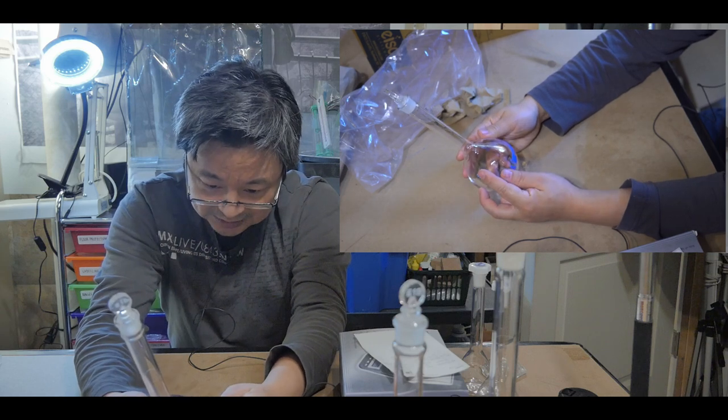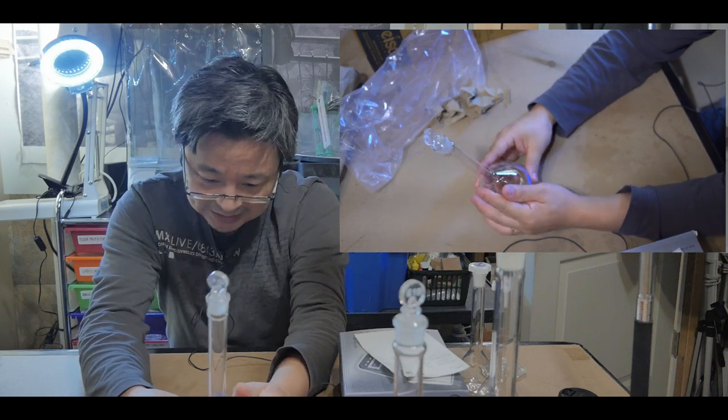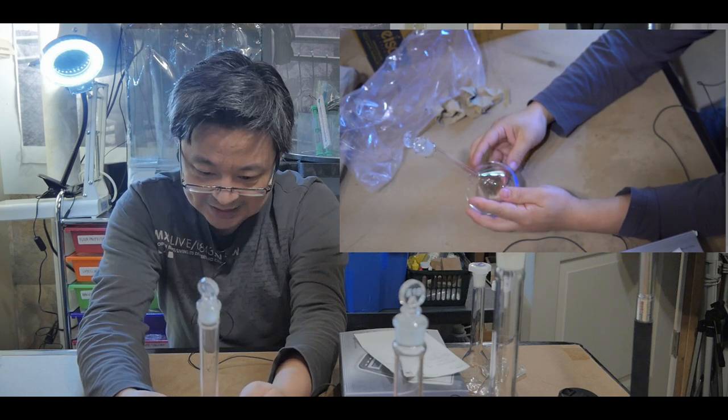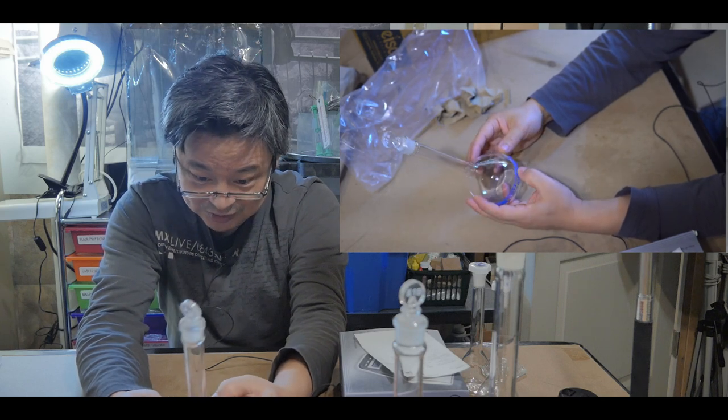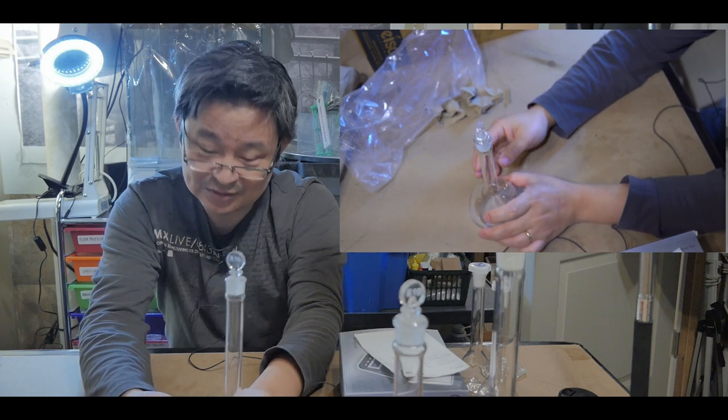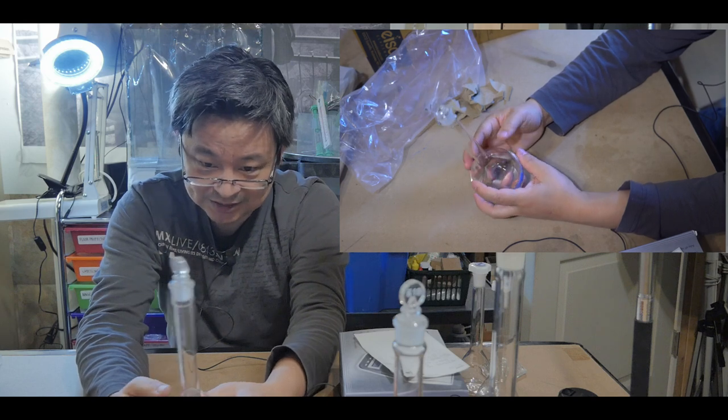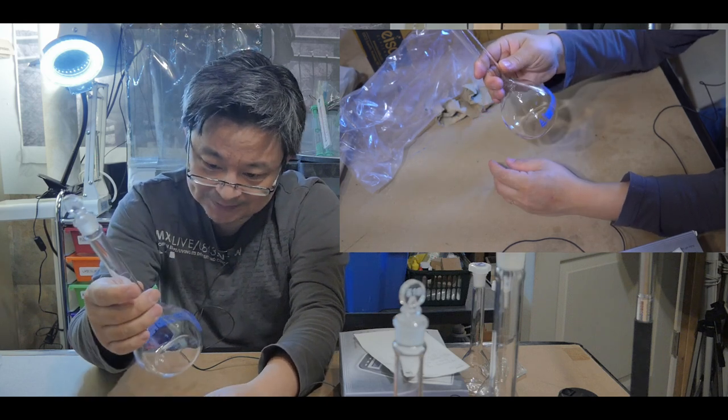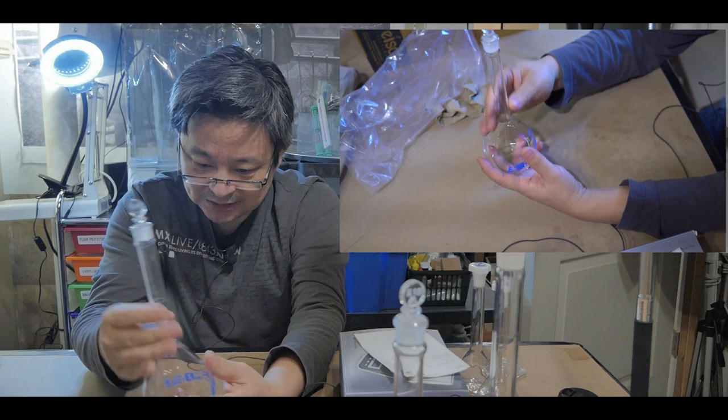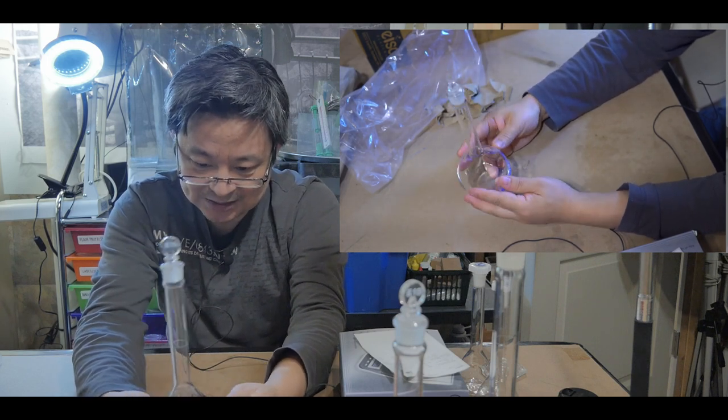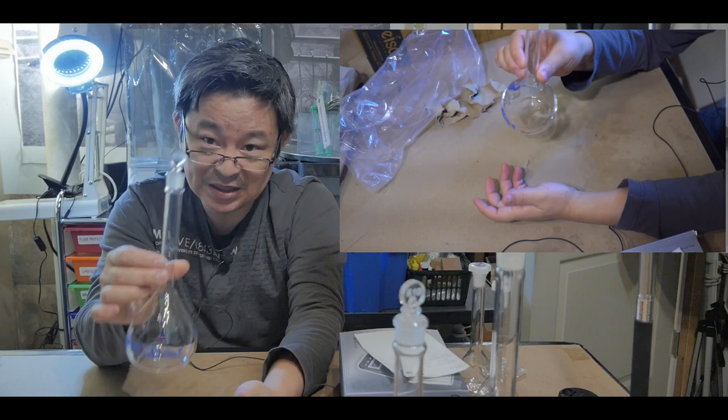Still, you know what, I'm not complaining. I'm not using any concentrated, like highly concentrated acid or base anyway, and I'm using a diluted solution, so this is fine. This is just fine. And I'm not using a high temperature solution, and so this is not going to crack or anything like that, although I will be using the magnetic stirrer to stir some of my solution. But I think this should be able to handle it.